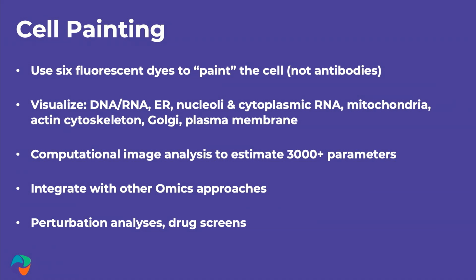You don't have to go into the details of all the organelles, just that you can visualize every major organelle in the cell by using 6 different dyes. And then you do computational image analysis to estimate 3,000 different parameters.